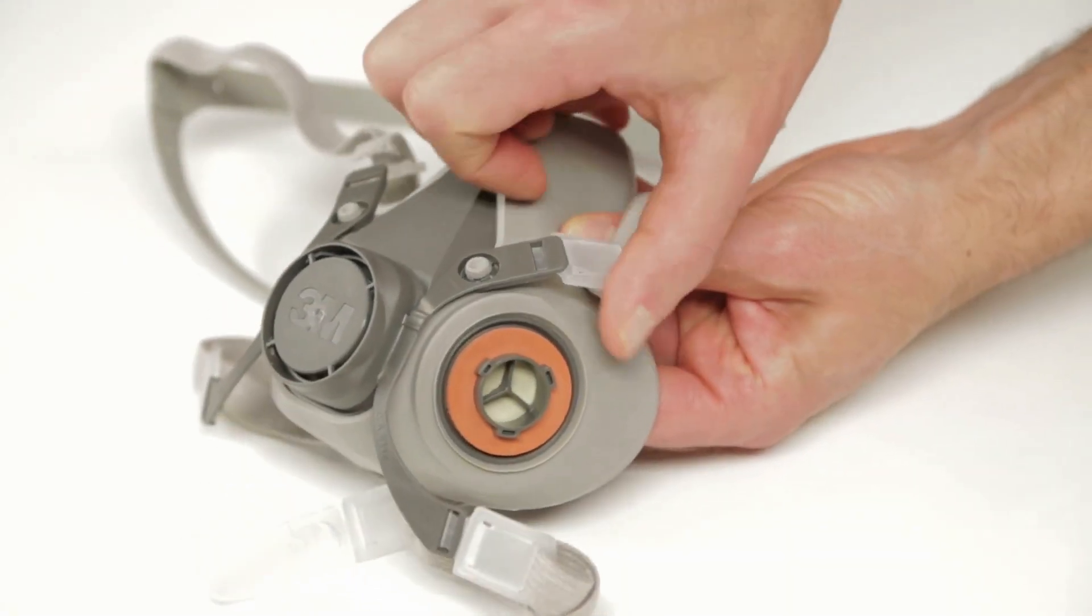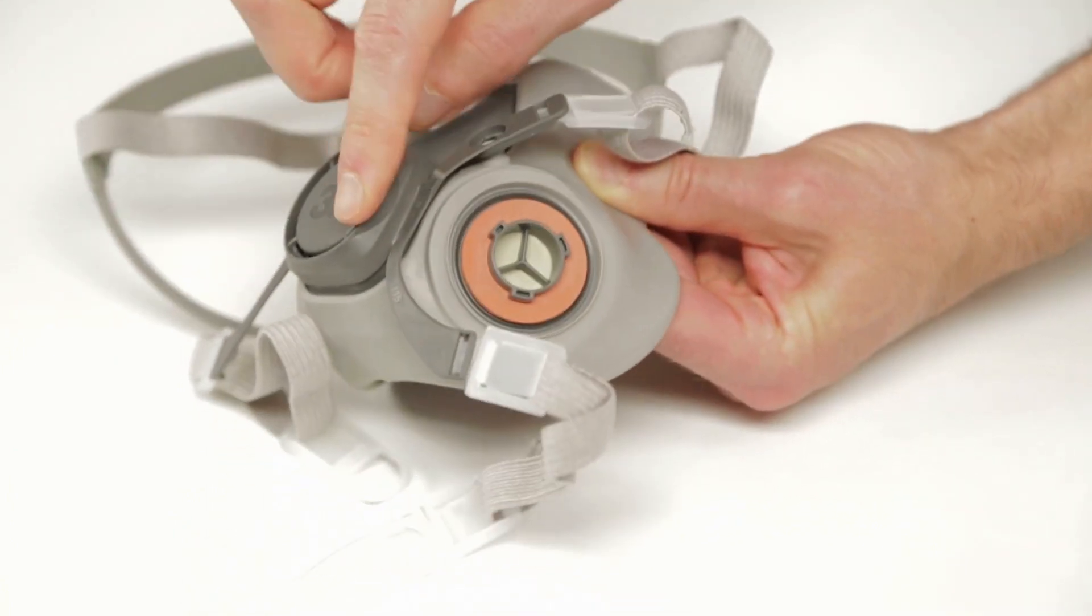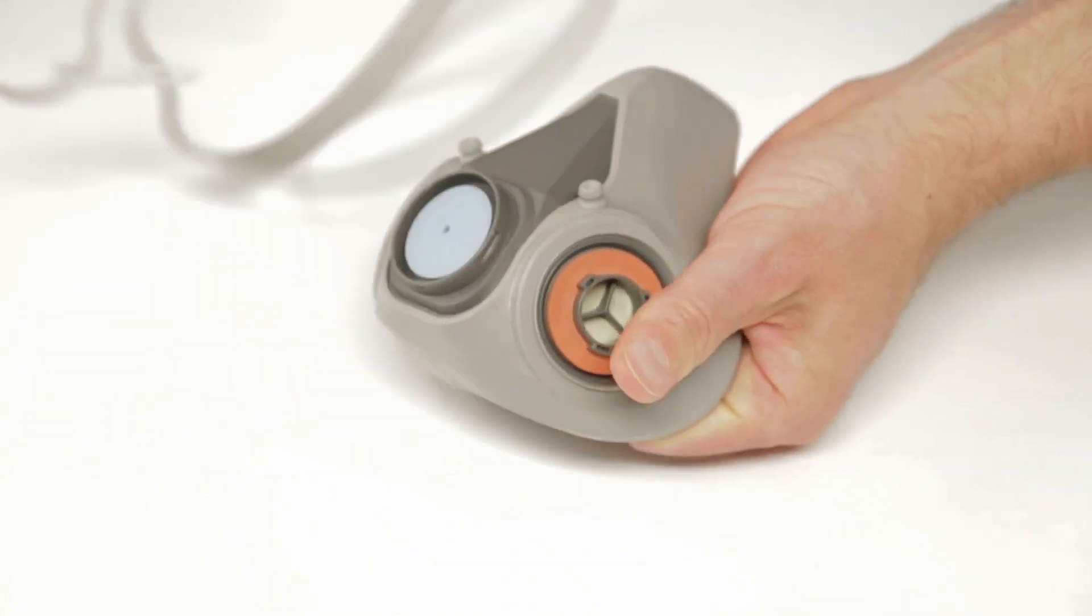To remove the respirator strap assembly, pull the upper legs from the facepiece buttons. Pry the valve cover assembly from the facepiece exhalation port.